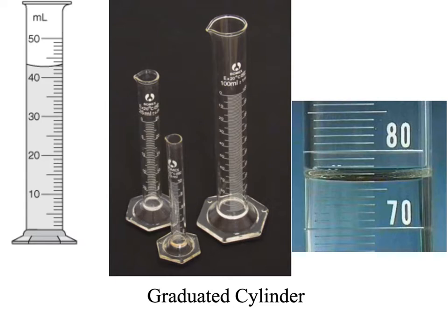The last piece of glassware you need to know is certainly one you'll be using a lot in the lab — it's called a graduated cylinder. We use graduated cylinders to determine the volume of a liquid. Running up the side looks much like a ruler, and wherever the liquid reaches you can read the volume. We always read to the bottom of the curved line at the top of the fluid, which is called the meniscus. So if we've got our 40 and 50 lines here, this looks like 43 milliliters of solution.